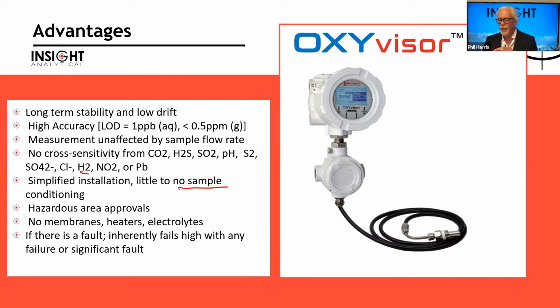The other thing I'll do is I'll take the probe out and dip it in a glass of water. So the probe's wet, because one of the things we worry about in our analyzers is water carryover, liquids carryover. So I'll purposely wet the tip of the probe, give it a little shake, dab it against my shirt, put it back into the T. Now, once enough nitrogen has flowed by to dry out any liquid that's left on the surface, it goes back to reading the gas phase concentrations just fine.